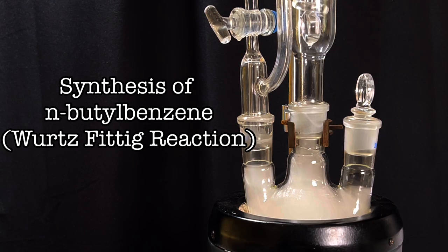Hello friends, in this video we will synthesize the aromatic hydrocarbon n-butyl benzene via the Wurtz-Fittig reaction. This synthesis has been adapted from Vogel's textbook of practical organic chemistry.